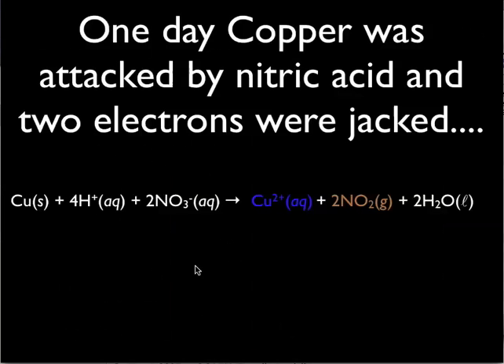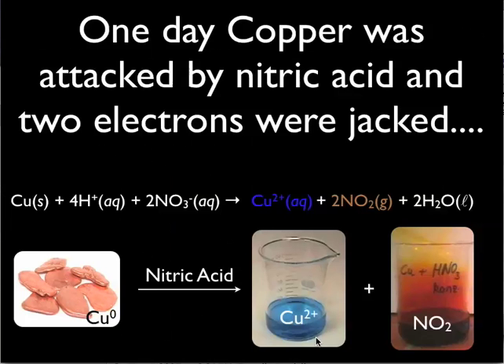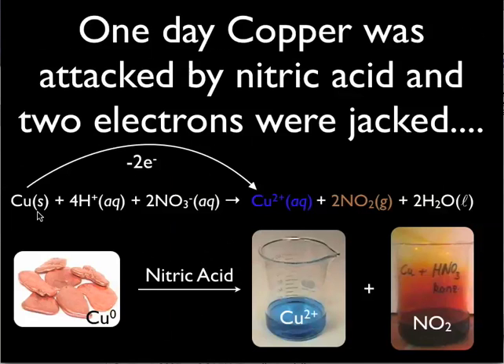We can change that situation by adding nitric acid to our copper sample. We go from this solid, shiny, lustrous metal to a solution of copper two ions, which is deep blue. We also get some brown gas evolving, due to the formation of nitrogen dioxide. What's happening is we're yanking two electrons from copper, going from neutral copper zero to copper two plus. The nitrate accepts these two electrons to become nitrogen dioxide, giving us the brown gas.